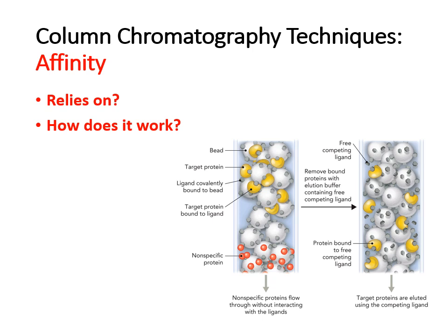So affinity relies on the binding or attraction properties of the target protein. And so with this, you basically will have a high affinity ligand for the target protein linked to the matrix bead. Okay, so over here in white, you see the bead itself. And then you'll notice that the little gray circles stuck to that bead are the ligand covalently bound. And that's a ligand that the target protein likes to bind to.